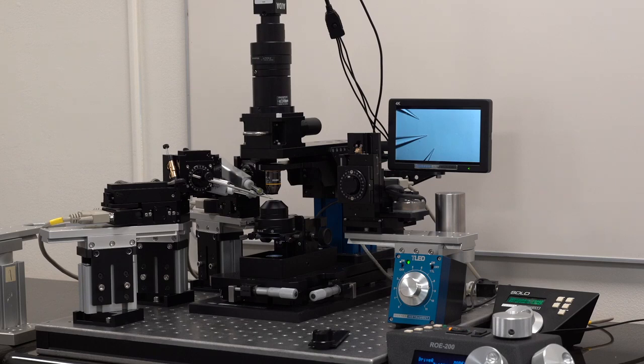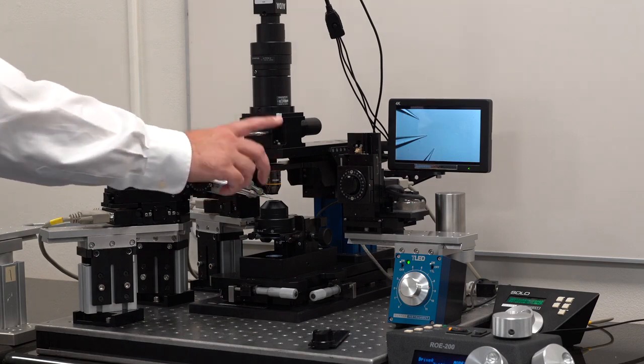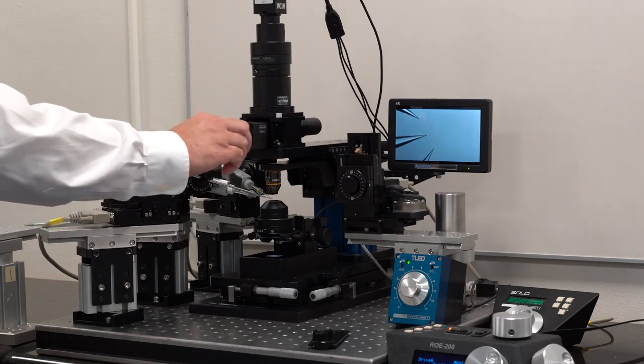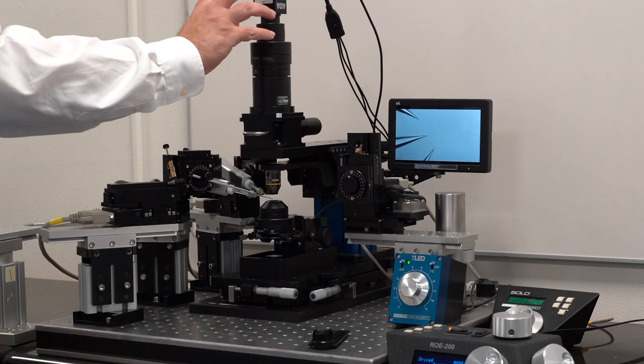This is another version of NAN that we are calling simple NAN. And what I mean by simple is that there is a single objective nose piece. A single filter cube, which you can change with no tools. There is no TRINOC. It is just an Olympus tube lens and C-mount for the camera.